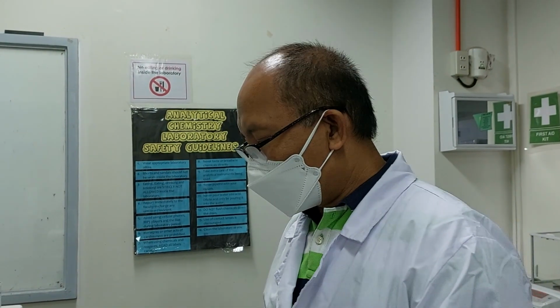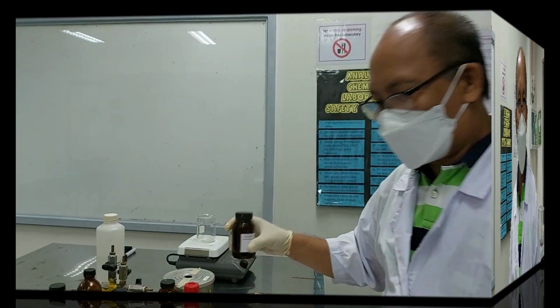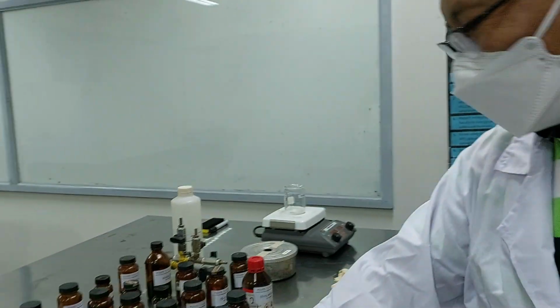Okay, so in this experiment, we're going to use ethyl bromide as representative for the reaction of alkyl halide. Since we are going to use silver nitrate, our precipitate will be silver bromide, no? And silver bromide is not white, no? It is the silver chloride that is white. Silver bromide is what do you call this? Dirty white.